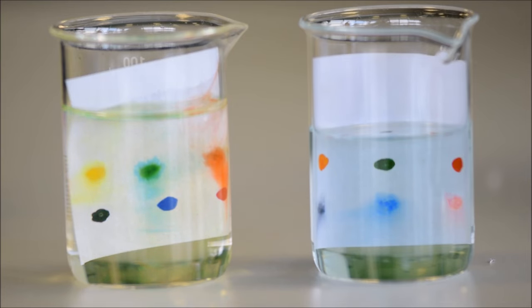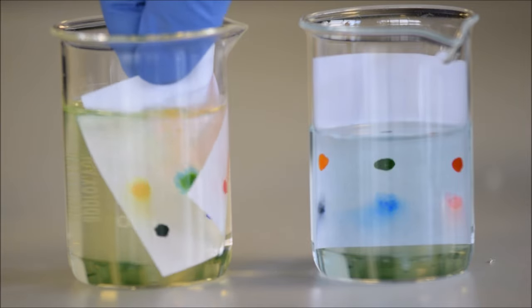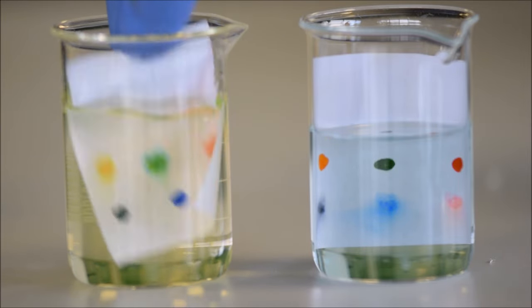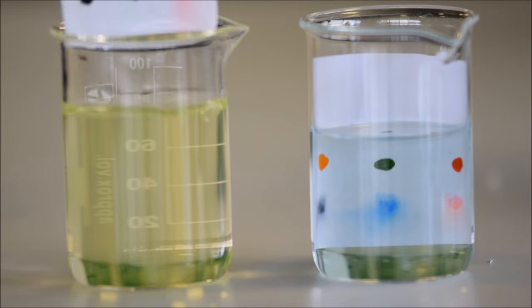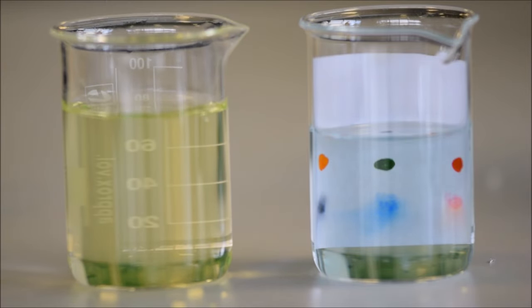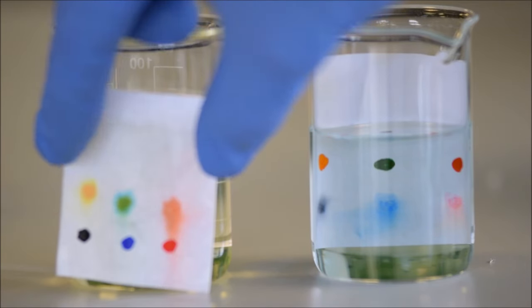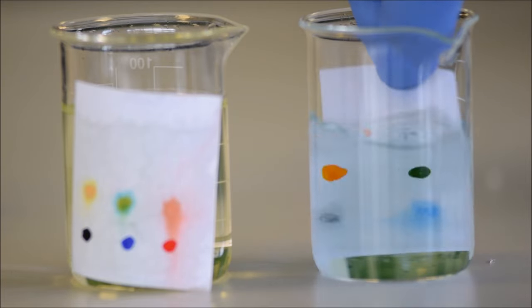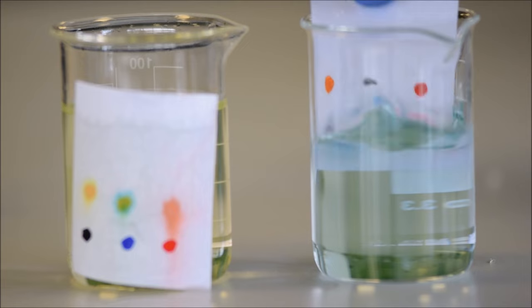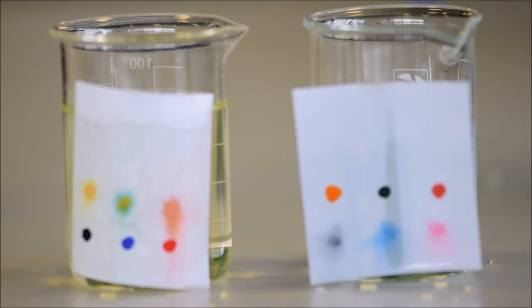The non-permanent ones are quite polar and dissolve easily in the water. The permanent ones dissolve easily in the dichloromethane because they're designed to resist dissolving in water and be permanent and not easily washed away. And so you can see, if we take the paper out, half the spots are untouched by one solvent, and the other half of the spots are untouched by the other solvent. And the two solvents have taken on a very different colour because I chose different colours of marker with different inks so that we could see the different layers.